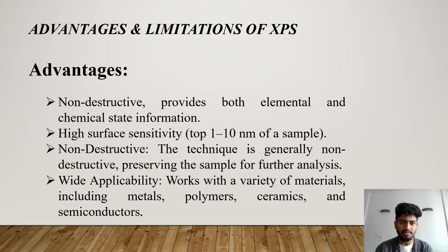So these are some advantages of using XPS spectroscopy. I'll start with the first point, non-destructive. It provides both elemental and chemical state information. It has high surface sensitivity, as I said before many times, analyzing to a depth of 1 to 10 nanometers of a sample.